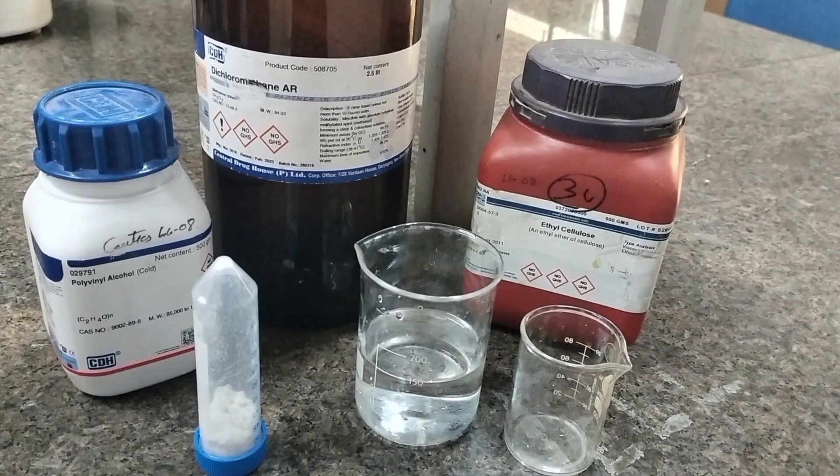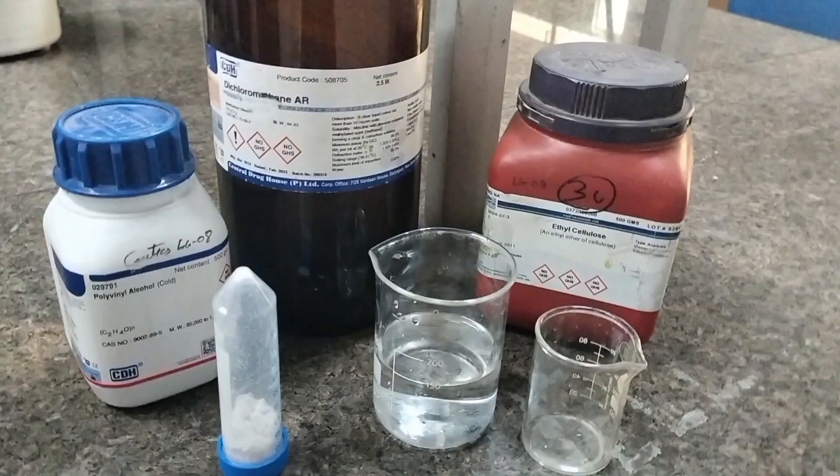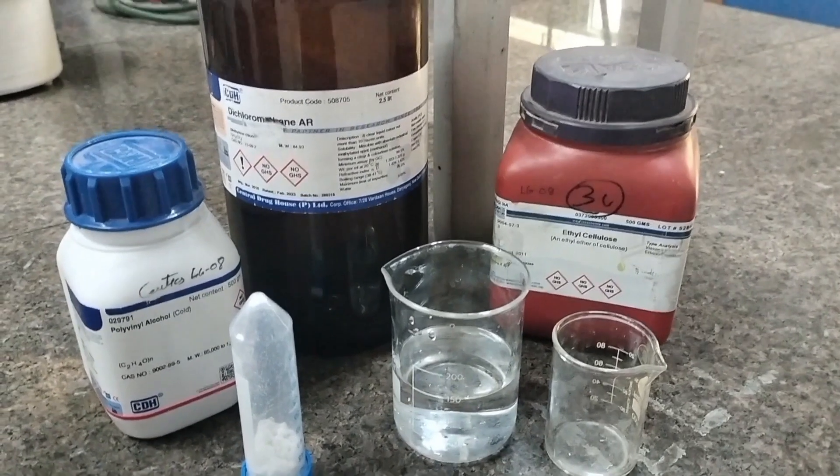Today we are going to prepare micro sponges by quasi emulsion solvent diffusion method. For this method, the required ingredients are ethyl cellulose, polyvinyl alcohol, drug, water, and dichloromethane.